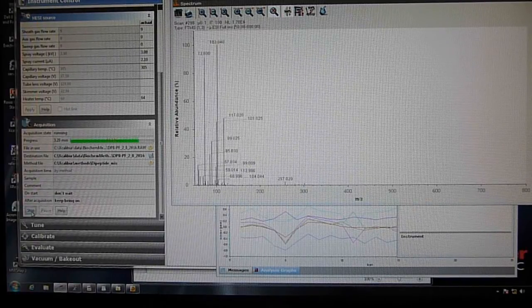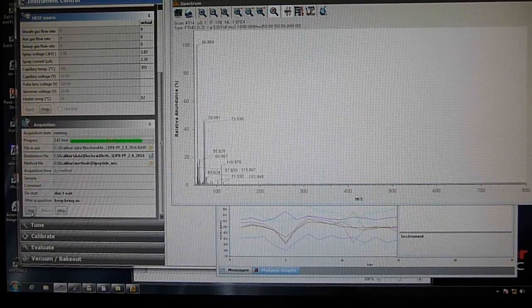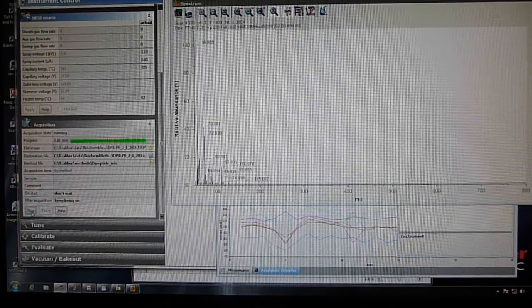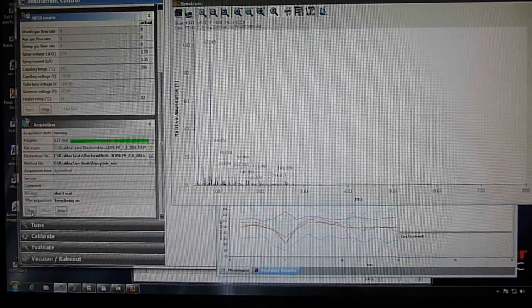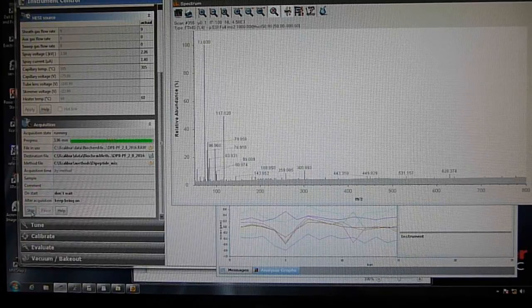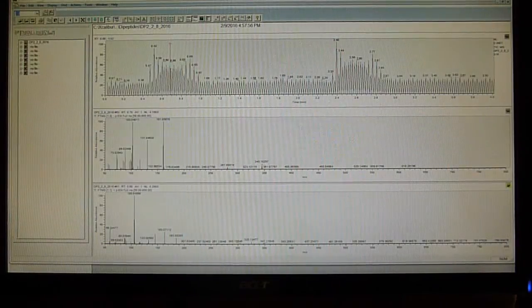And the data file, let's see, acquisition is going to stop now, so I am going to stop this part. Alright, so data acquisition is stopped.